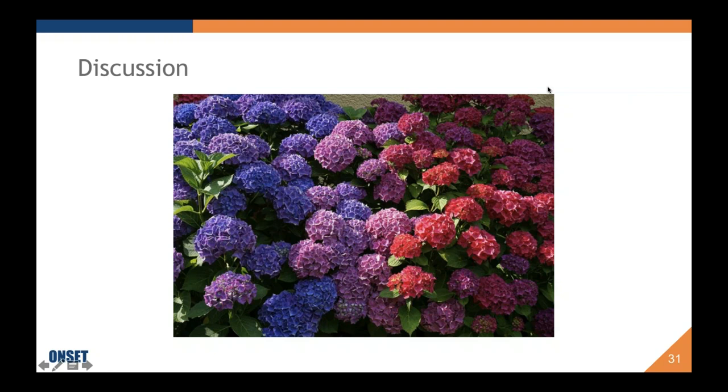How will this hold up in a municipal wastewater plant? I can check our customer base in terms of who has purchased and used it thus far. So that's something, Stephen, that Inslee and I can both look into. Well, I can actually answer this one. In a municipal wastewater plant, as I said earlier, the pretreatment part is sludgy and kind of gross, so it's possible that the logger and electrode will get dirty pretty easily. In that case, this probably isn't good for the pretreatment side, which means users would have to continue to do spot checks or use industrial grade pH electrodes in line.